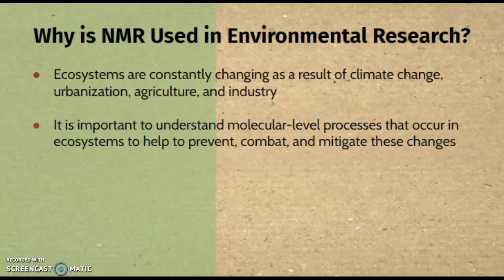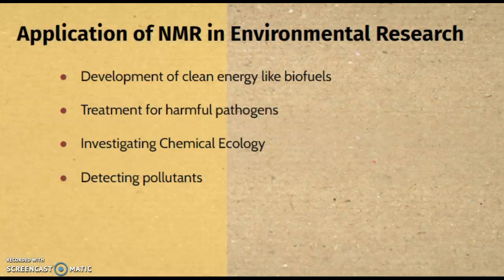And with that information, we can help to prevent, combat, and mitigate these changes, as well as reverse some of the negative side effects that we've caused. And some of the applications of NMR that have been used in the past in environmental research include developing biofuels, treatment for pathogens, investigating chemical ecology, and detecting pollutants.